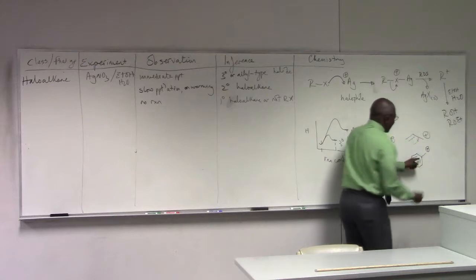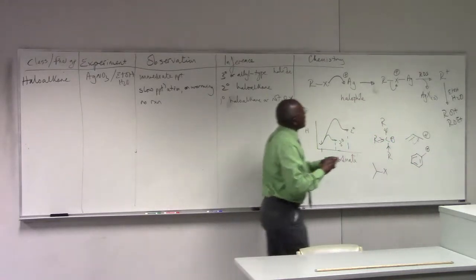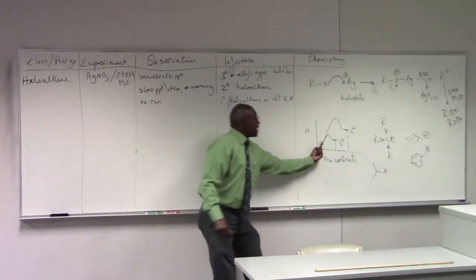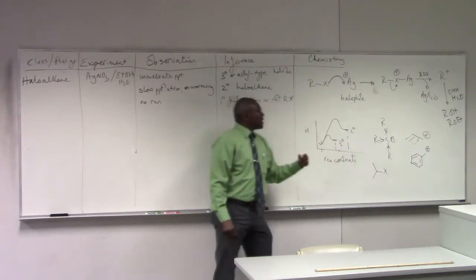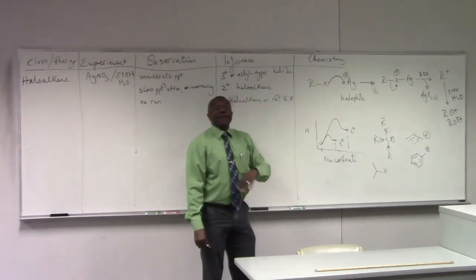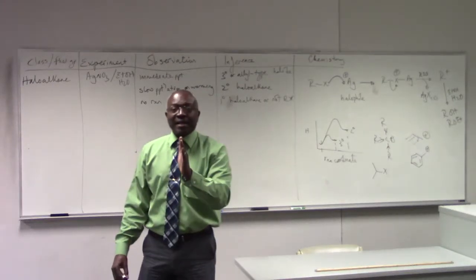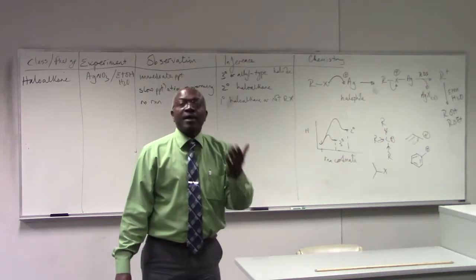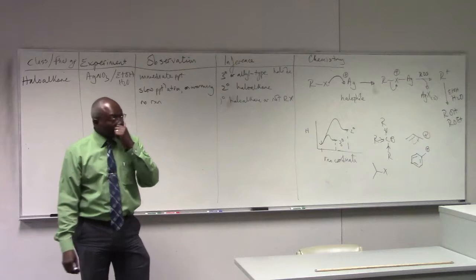That's why we call them allyl type, because they look similar, resonance stabilized. If I see a precipitate form after warming, so I'm giving it the energy to climb the barrier, and that's going to take some time, then that's secondary. If I don't see a precipitate, then it means either it's a primary haloalkane, which will not form the carbocation, or it's not a haloalkane at all.